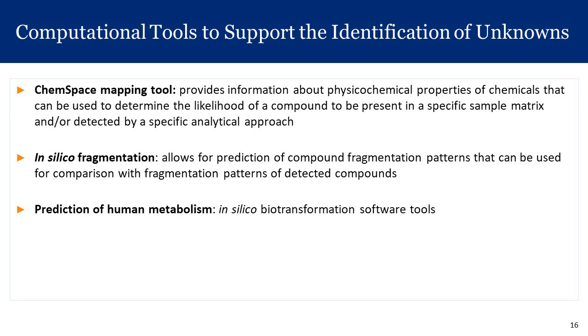And if you don't have a reference compound, either a reference standard in the lab or a data point in a spectral library, you can use these in silico fragmentation tools to get a better prediction of if you fragment this compound, is it really leading to the fragmentation pattern that you're seeing in your analysis? So this adds a level of confidence into the identity of the compounds.